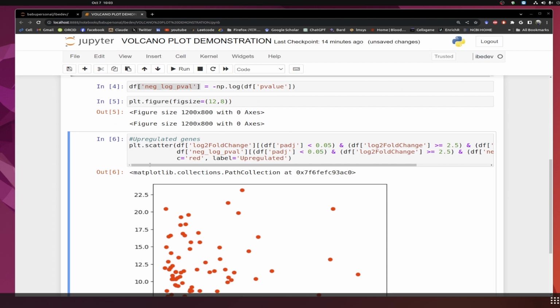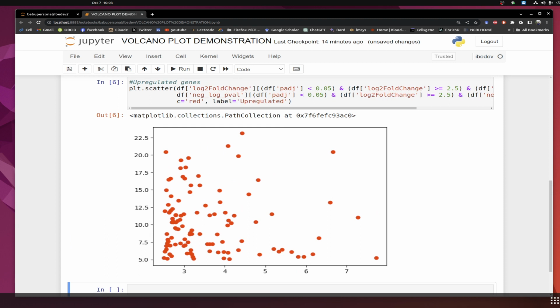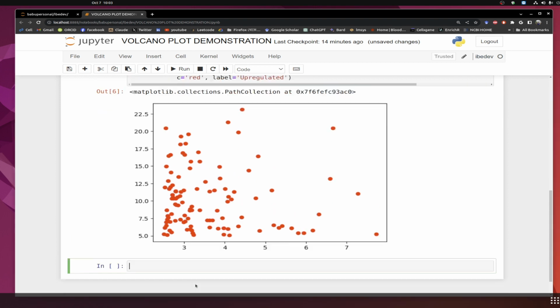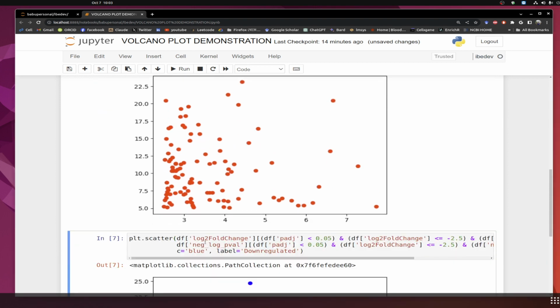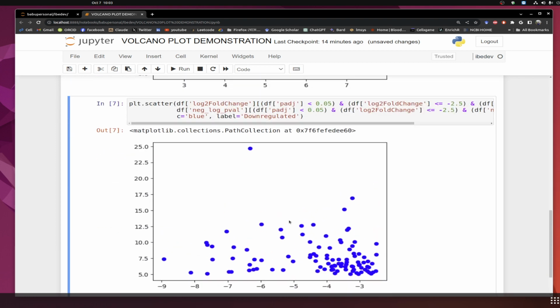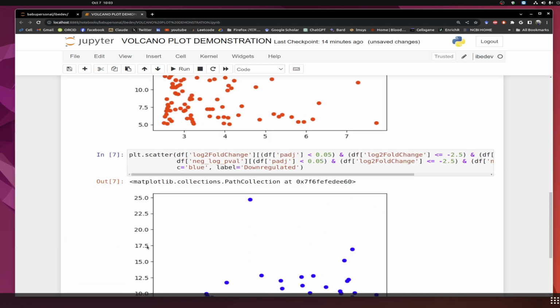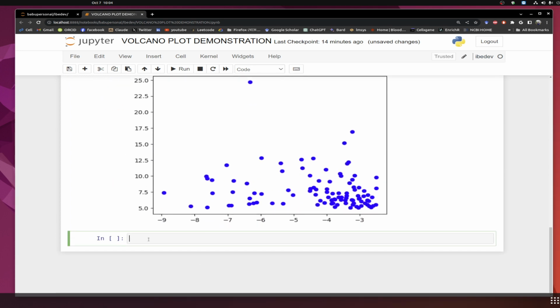So what we will do is go to a similar setup for the downregulated genes. So we do the similar setup for the downregulated genes. That's in here. So you can see we have defined the different colors in here, red color and blue color. And then we are thinking of adding the gene name. So we have set up certain parameters in here, and we set up the for loop over i.